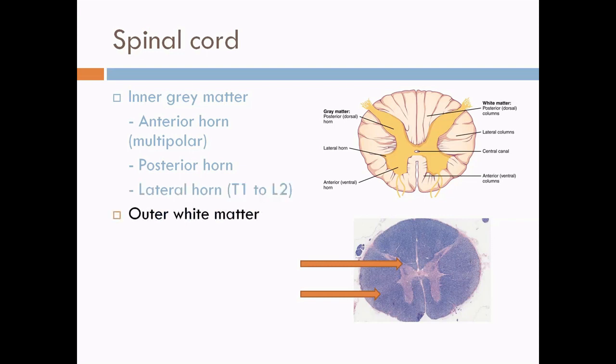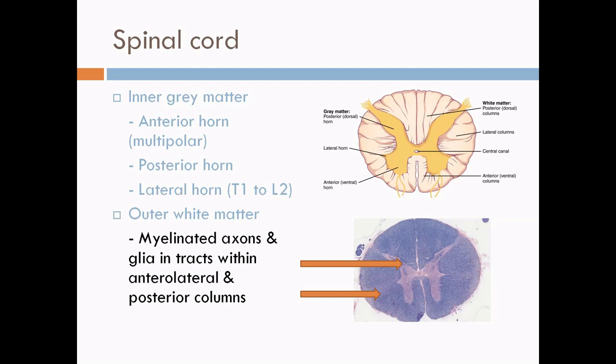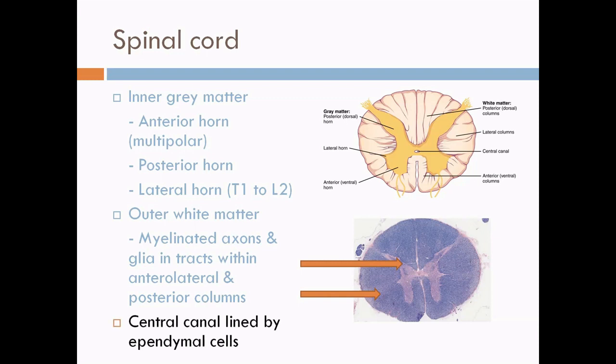The outer white matter contains myelinated axons which are arranged into the anterolateral and the posterior white columns. The central canal of the spinal cord is lined by ependymal cells.